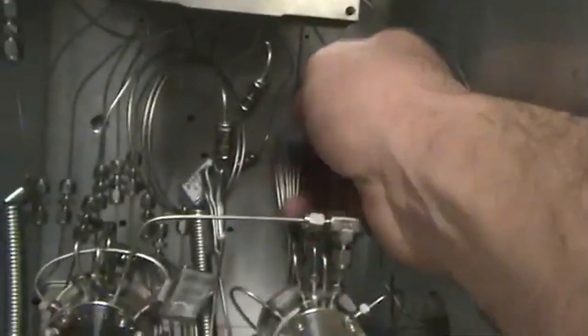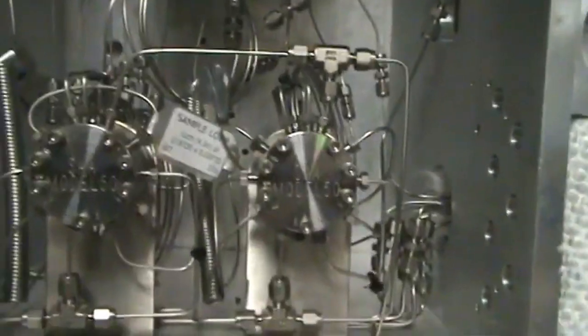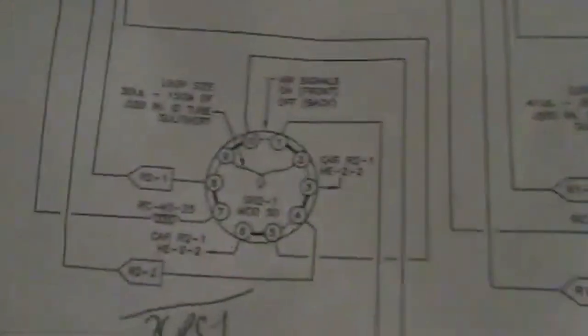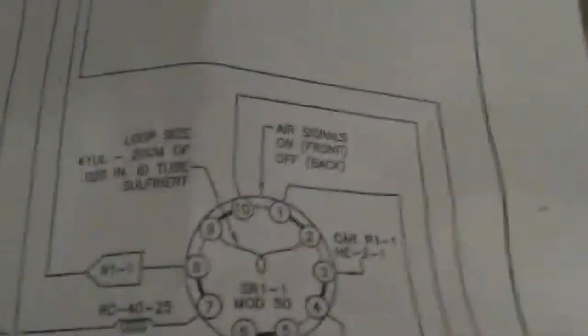These are columns for separation. These are our tubes going to our detectors because they got to have the carrier gas pushing our components across our detectors. Carrier gas 3 and 6. Carrier gas being helium.